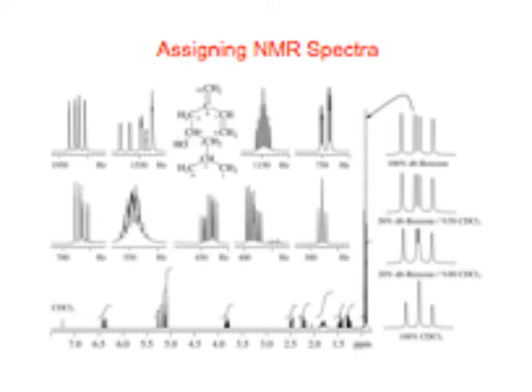It doesn't give you specific stereochemistry, but that carbon has four different groups on it, right? So it has to be chiral. Doesn't matter what the chirality is, or even if you had a racemic mixture. If it was a racemic mixture, it would still be the same. You just have two mirror image compounds, and enantiomers behave the same in an achiral environment.